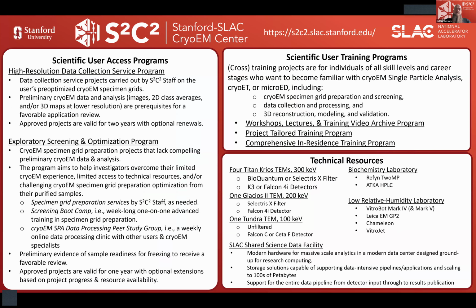Hi, everyone. I'm Nathan from S2C2. Just like the other centers, we have the suite of equipment and technical resources from Krios to Glacios and a Tundra on the way. It's currently being installed. We're excited for that. You can grab a screenshot here and learn about our programs.